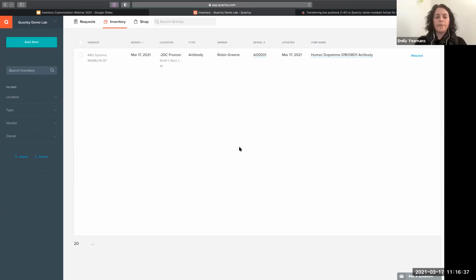There are a lot of questions about the expiration and reorder date, which I know Katie is going to get to in a second. So let's see if she can answer some of these questions going through that section of the presentation. Any other questions about the freezer box and the locations? All right, cool. So we'll go on to importing and exporting.